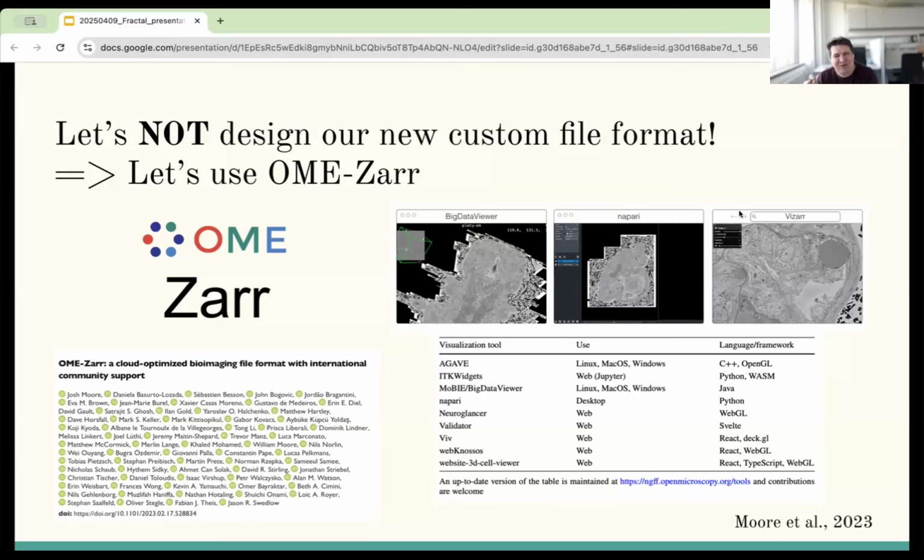But beyond just fulfilling the few spec items, the really cool thing about OME-Zarrs is the large community of people that put effort into building things around them. Puha showed these papers before, but the thing that always really impressed me was the diversity of viewers that exists, that allow you to view different kinds of image data that's really optimized for EM, optimized for light microscopy, optimized for high content screening plates. And it's really nice that this ecosystem already exists.